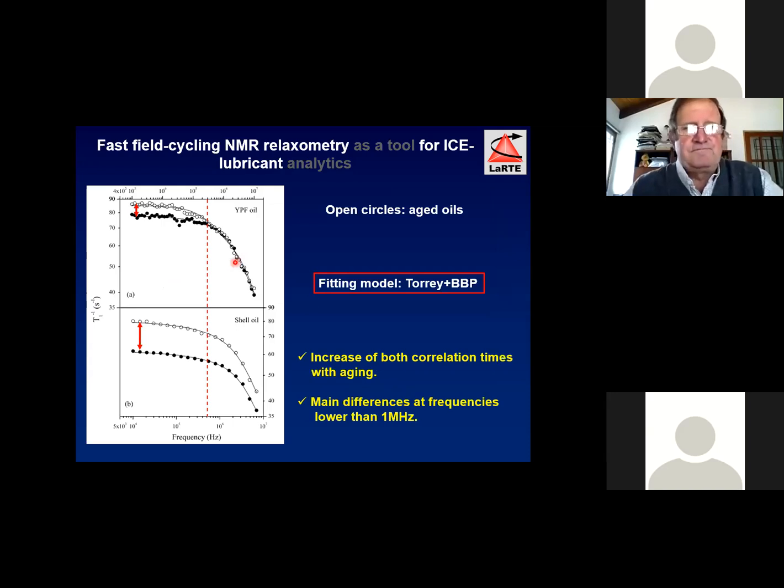Here, what you see, these are two different engine oils. This was used in a truck engine, and this is a car engine, different oils. The details of the degradation don't matter. This is a very complex process because in an engine, you have many different pathways working in parallel for the degradation of the lubricant. But the point I want to show you, and I want to stress from now, is that the highest sensitivity is reached at low frequencies. Okay, this is an important point.